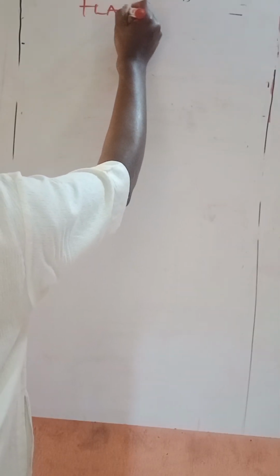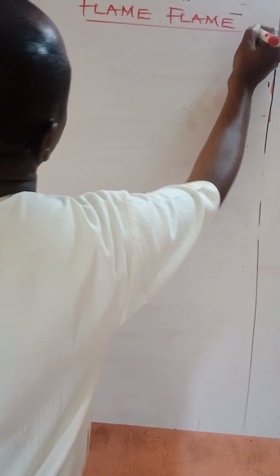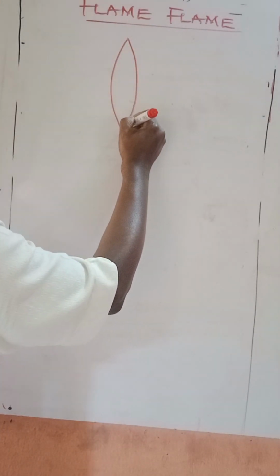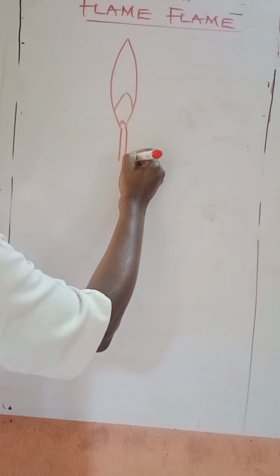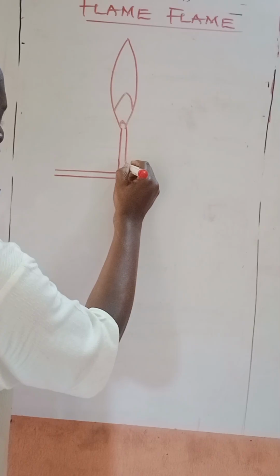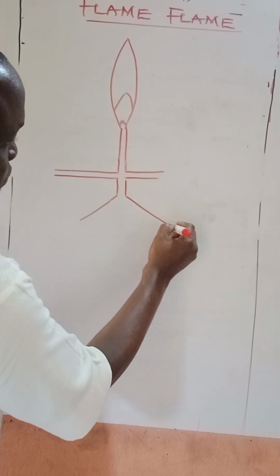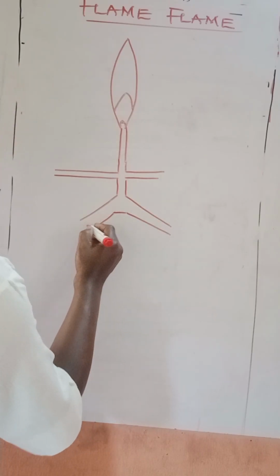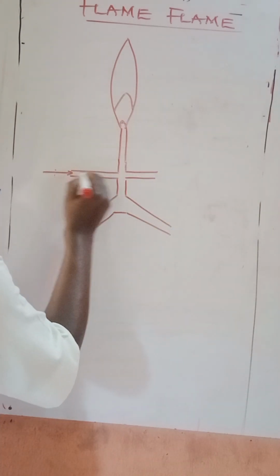Flame test. Let's label the flame itself. Here we have the air.